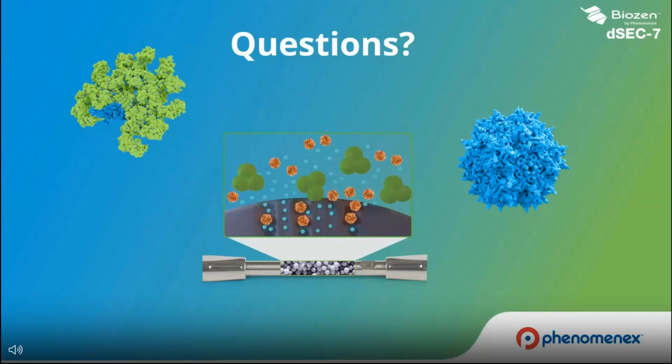Yeah, so whenever you're looking to transfer a method to look at the different size variants, one thing you always have to know is the size limit, right? And it's all stemming from sample preparation all the way to the analysis itself. So typically for HPLC or UHPLC, there's tubings and injectors. They all have very, very narrow IDs. So if you're interested in looking at things that are really, really large, like micron size or really large aggregates, you will not be able to see that on the size exclusion chromatographic column or any type of LC column if you're injecting into an actual LC system.